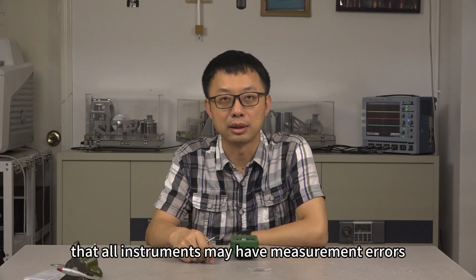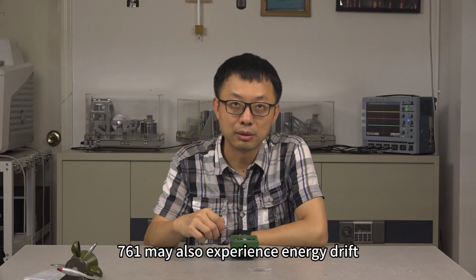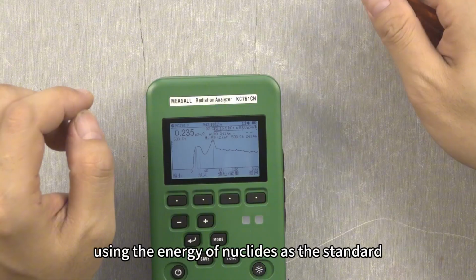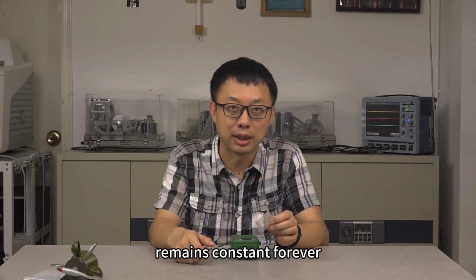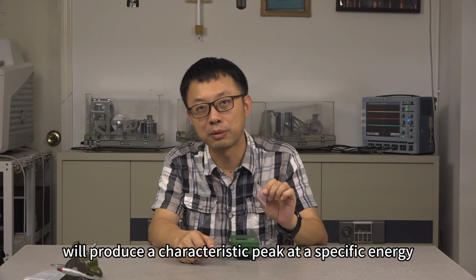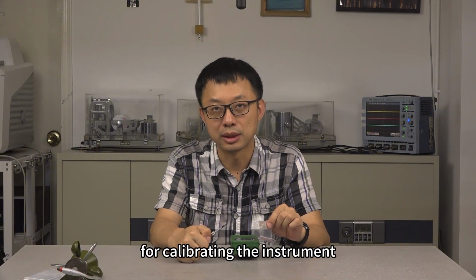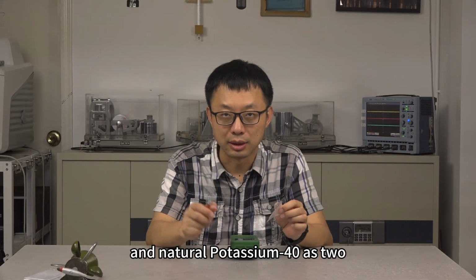Additionally, it's worth noting that all instruments may have measurement errors. It may also drift over time. The 761 may also experience energy drift. Instruments are calibrated using the energy of nuclides as the standard. The energy of gamma rays emitted by the same gamma nuclide remains constant forever. That is, if you know the measured substance will produce a characteristic peak at a specific energy, then this peak can serve as the gold standard for calibrating the instrument. At this point, you can use your own americium-241 and natural potassium-40.